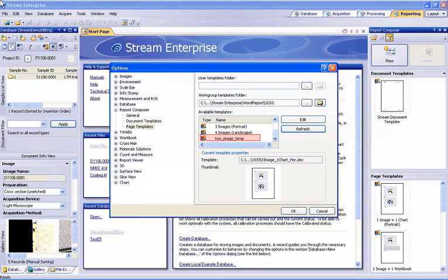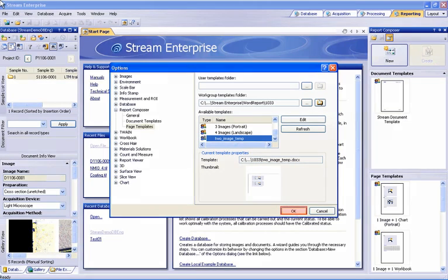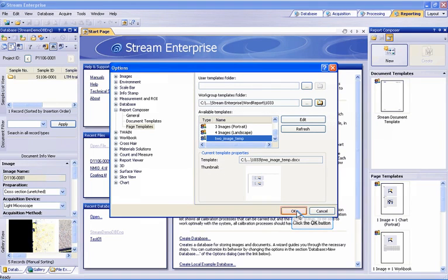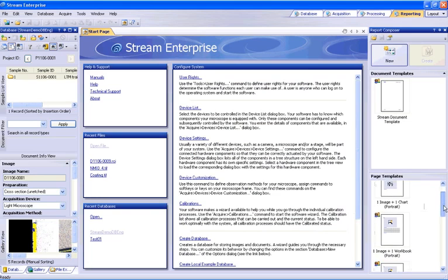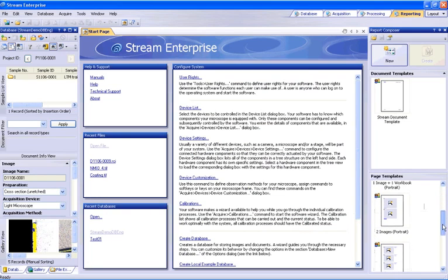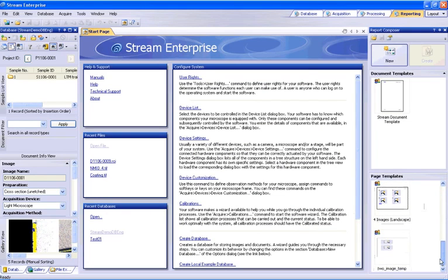You can now see the template we created within the list by scrolling to the bottom. Select OK to close the Options window. The new template has also been added to the Page Templates list within the Report Composer tool window. Scroll down to locate it.